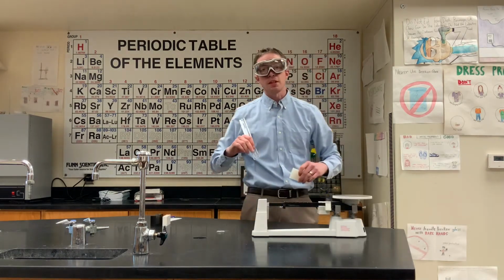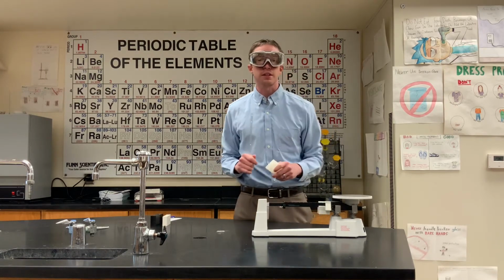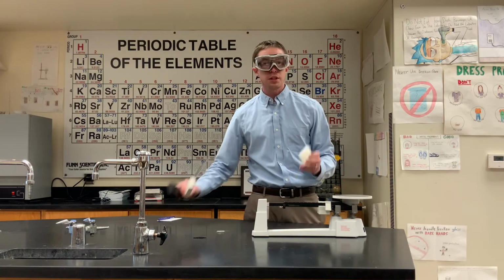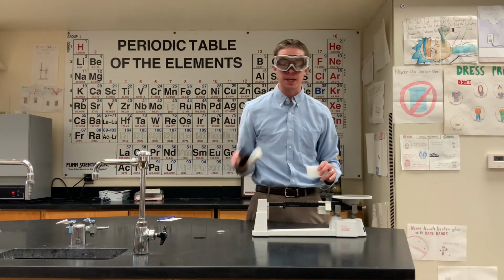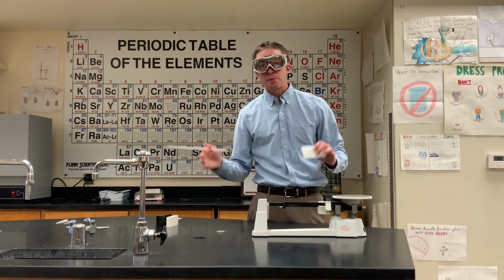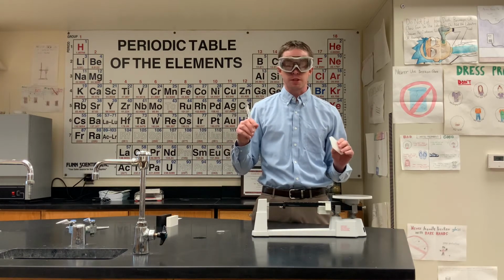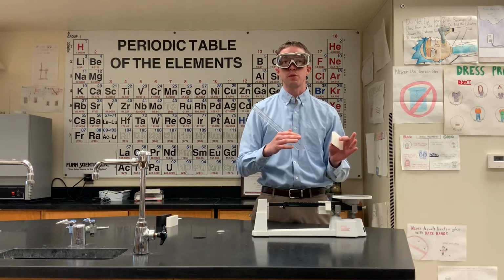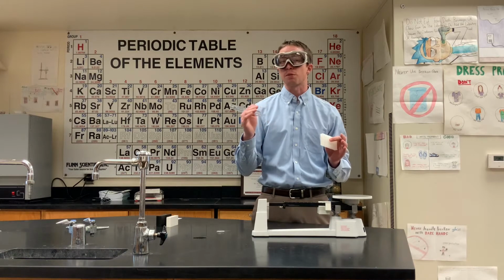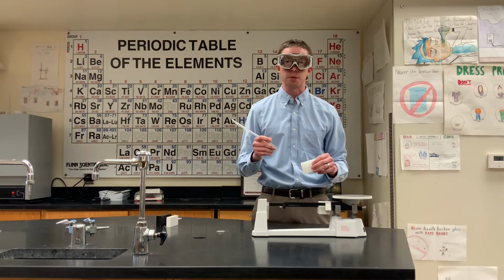All right, everybody, and here we are back. We're about to calculate the densities of 3 different kinds of plastics here. We have a cloudy plastic, a white plastic, and a black plastic. At first, I'm going to show you how to go about measuring the dimensions in a proper and precise way for the cloudy block, and then we will put the data for the black and the white block up separately, but we're not going to show you how we did all those measurements.